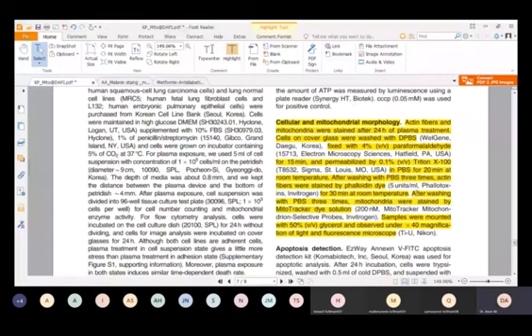After washing with PBS 3 times, mitochondria were stained by the MitoTracker dye solution. Then the same sample they used for the mitochondrial staining. So the sample is the same. They used 2 dyes to stain the actin fiber and mitochondria. For actin fiber, they used phalloidin dye, and for mitochondrial staining, they used MitoTracker dye solution. And when they were done with the staining, they observed the sample under a fluorescent microscope. And under the fluorescent microscope, how the sample looks like, I'm going to show you the pictures taken.